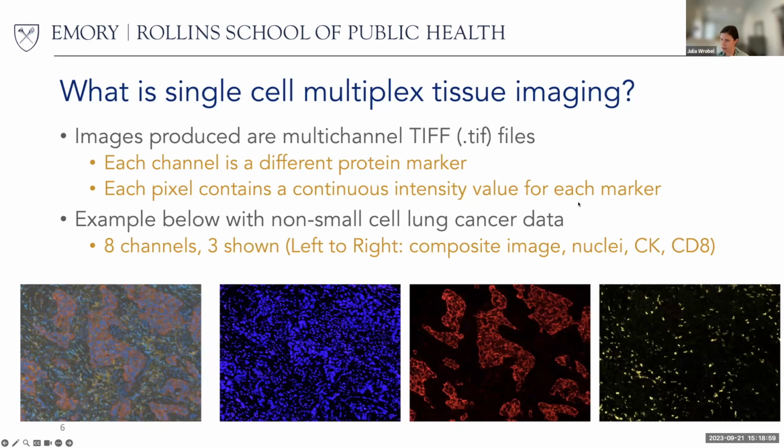So I would say there are 2 answers to that. There are a couple different ways that you can attach them. One is through fluorescence, and another is where we attach and then image them. For the fluorescence ones, if you have too many different types of proteins you're attaching at the same time, on the tissue end they can attach pretty specifically to the protein. But on the actual visualization end, there can be overlap in the fluorescence of the channels. And so it can be hard to deconvolute the signal and figure out which protein you're actually imaging. So that limits the number of channels that you can have for one given staining, as they call it, when you attach the proteins to the tissue.